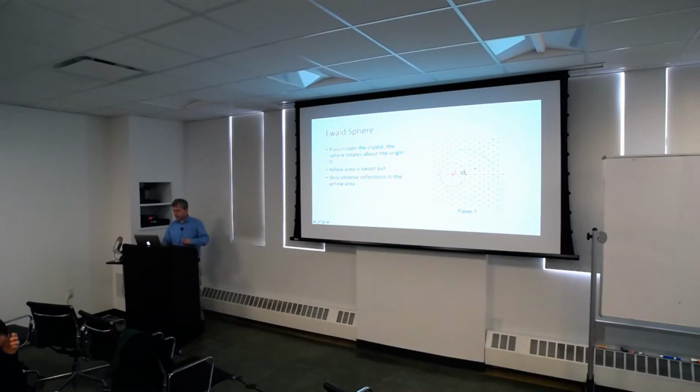This is all very basic 3D crystallography, and hopefully you're all familiar with it. I think it's a restatement of the Bragg's law, right? Yes, it's another way. Yes, indeed. Yeah, because it's another way.